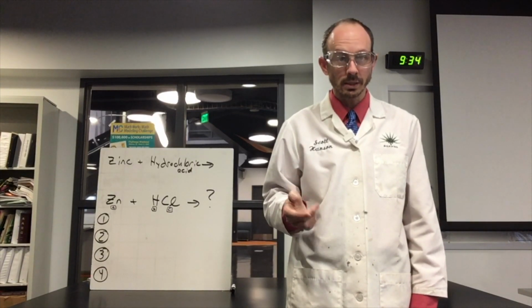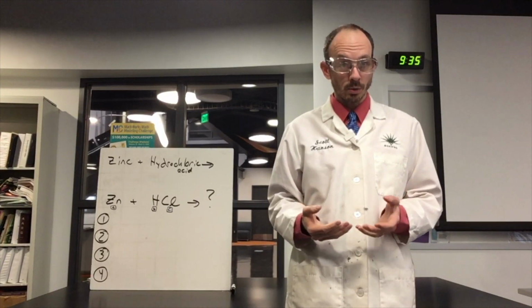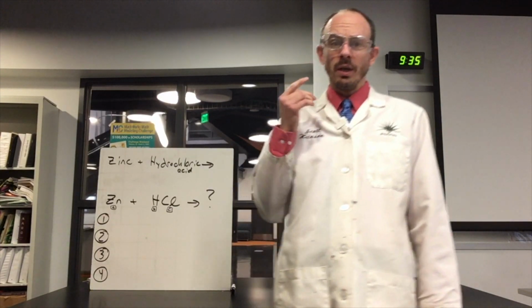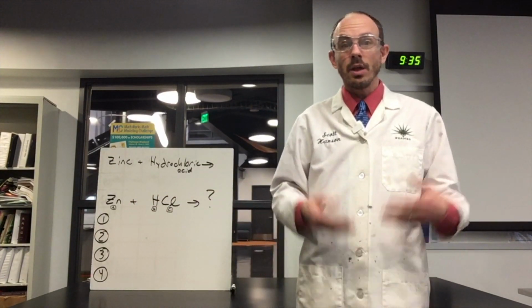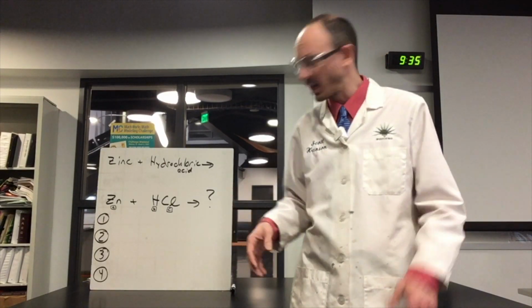Morning, ladies and gents. Today we're going to be exploring those ideas of relative masses with zinc and hydrochloric acid. So, very first thing that we need to realize is that when we are reacting zinc and hydrochloric acid together, there are a load of different possibilities which it could actually create.